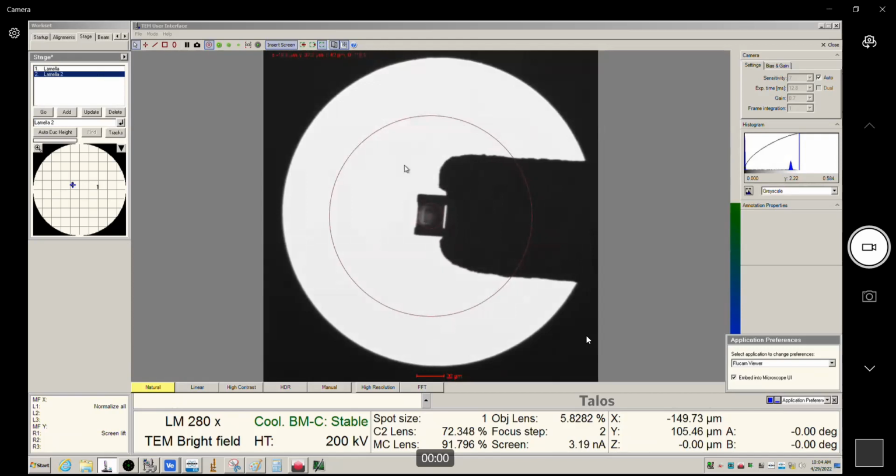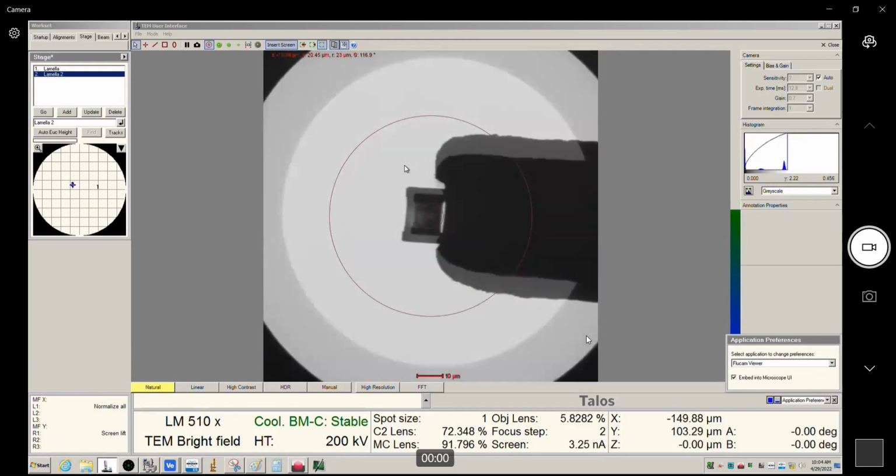On something like this, obviously you only have 2 lamellas, so it's not really difficult to lose things. If you're working on particulate samples though, maybe you have an opening in a grid and you notice something interesting in one of those openings, and maybe you want to come back to it later. You can store the position of it and then come back to it if you wanted to do something on it later. So that can be potentially useful depending on what it is you're after. So you do have the ability to store stage positions.